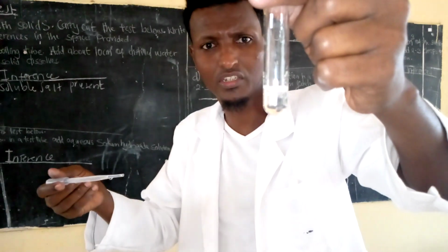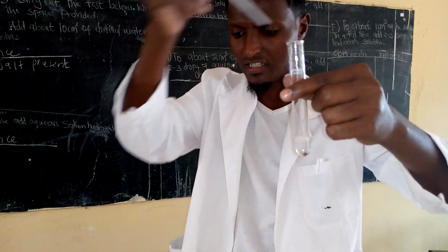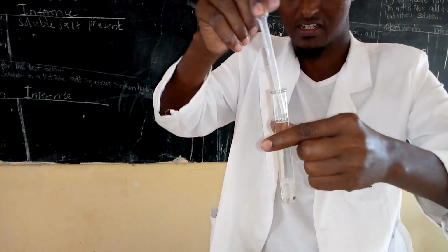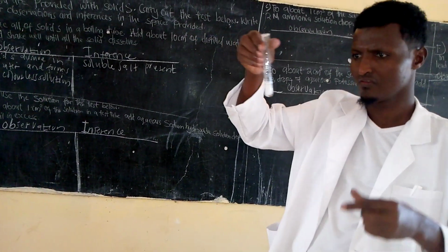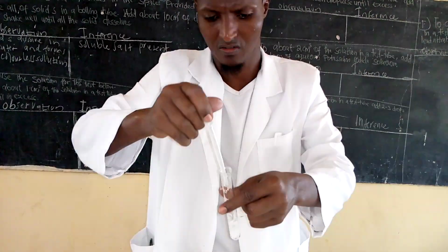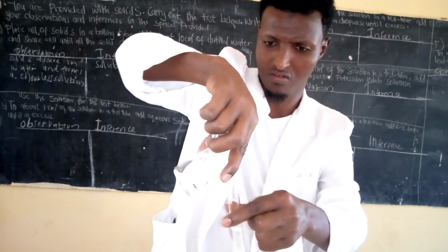Dropwise, you are seeing white precipitate, formation of white precipitate. Let me add in excess. In excess, no limit, in excess.